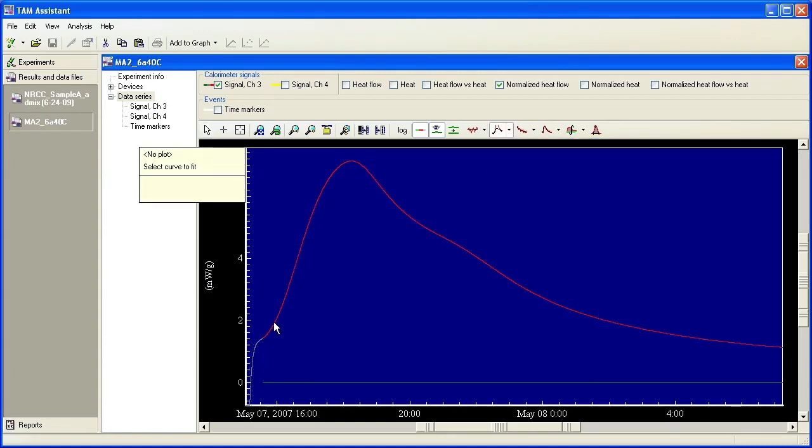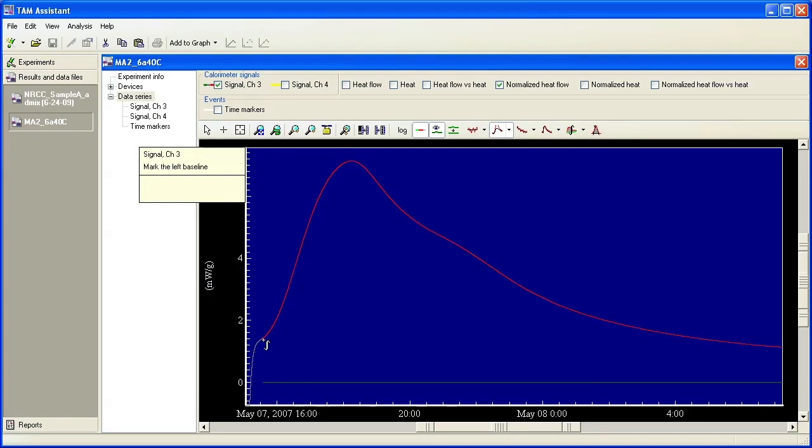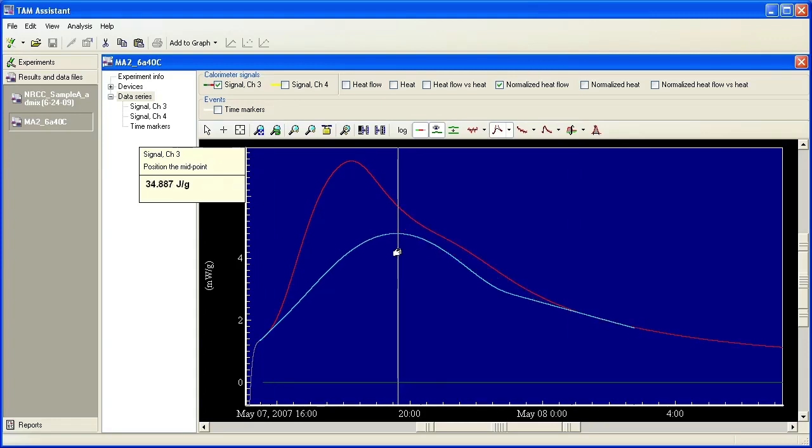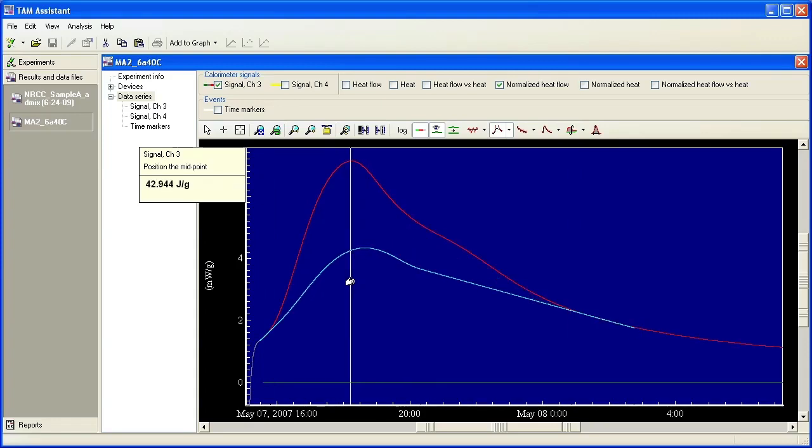I'm going to select the curve and then it says mark left baseline and I'm going to mark right baseline and you see I have this odd sigmoid. So I'm just going to kind of move it. It's not really the ideal curve here, but I'm just showing the operation.